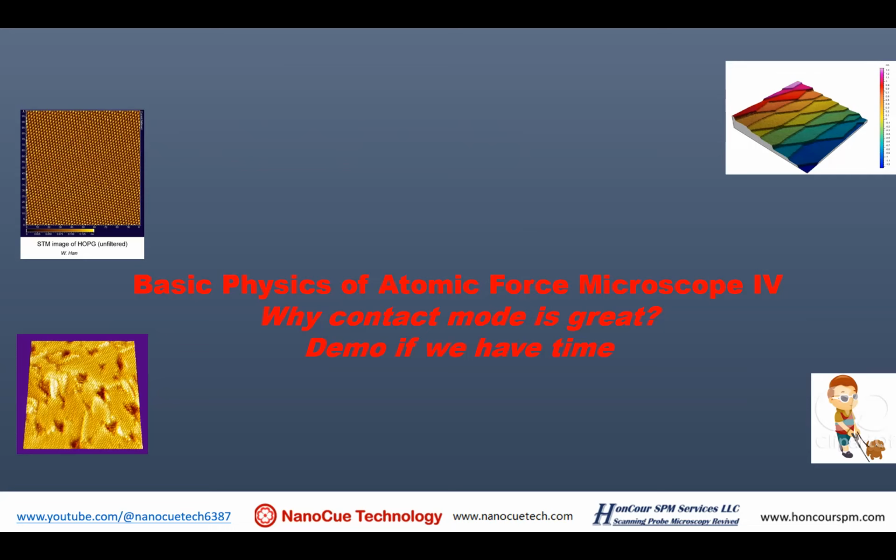It's almost like the relationship between a camera and your picture, or your piano and your music. You can have the greatest piano in the world and still be a very bad musician, and you could be the best musician with a very bad piano, and it does not prevent you from being a great musician. So I try to say, you don't need the expensive AFM. If you know what you're doing, you can have great things happen with your existing old instrument.